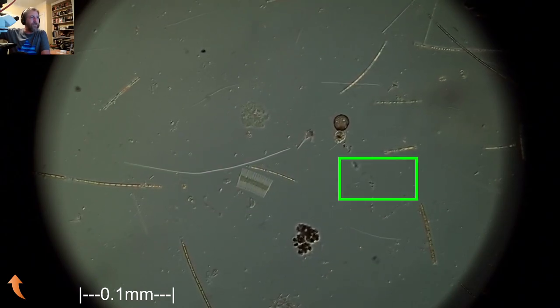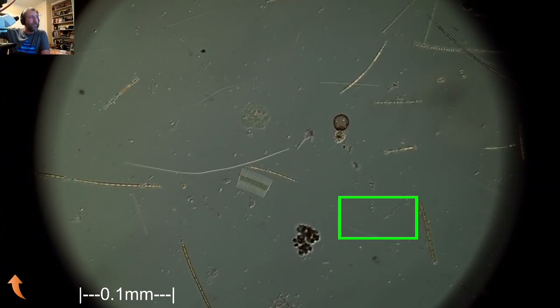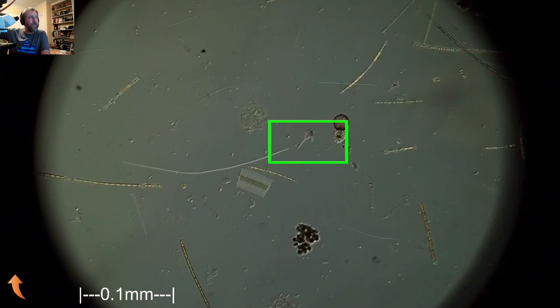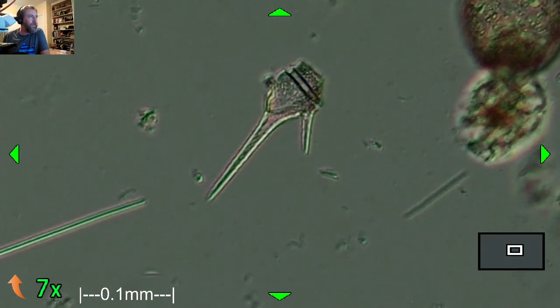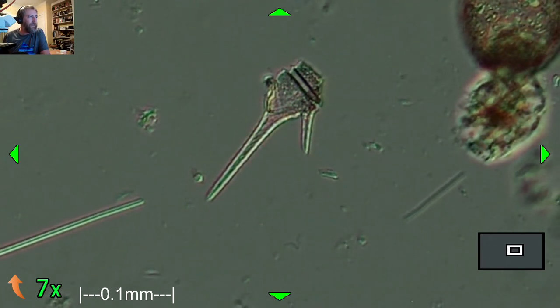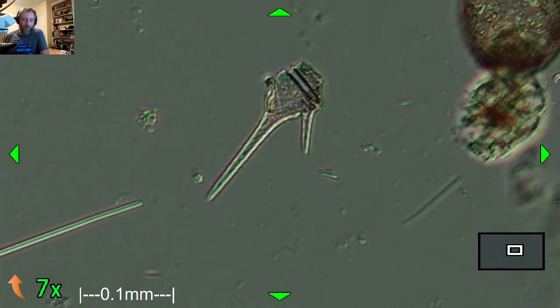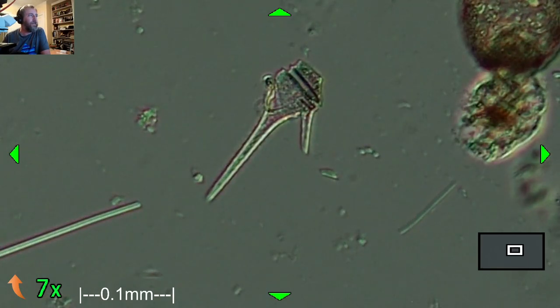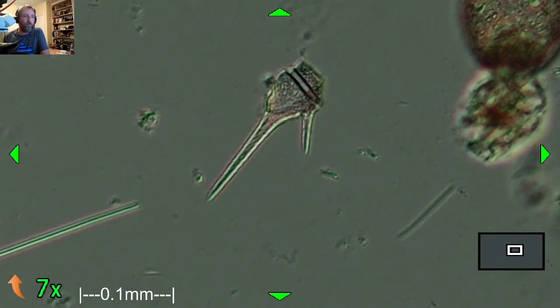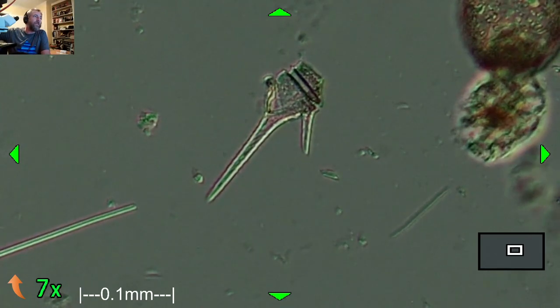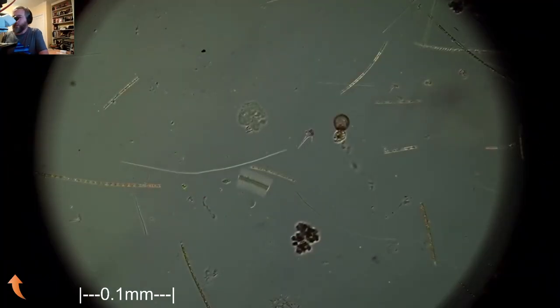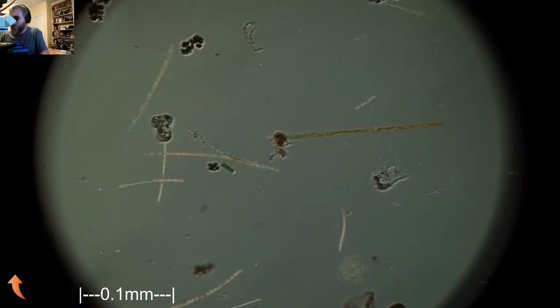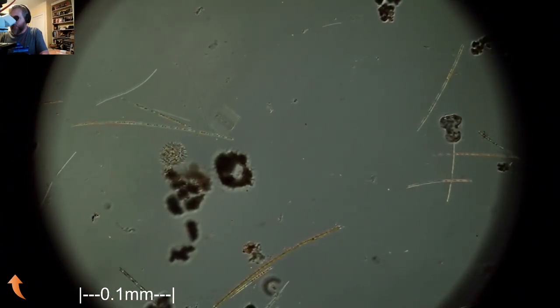So these are Fragilaria crotonensis. This thing over here is an Olicacira in that box. And that's another testate amoeba doing something. Maybe splitting. But I think this thing right here might be a dinoflagellate. Yeah. That looks like the sulcus, or the little thing, you know, the belt that goes across the midriff. And then it looks like it's made of a bunch of plates. So Tripos, I don't know what the, you know, I don't know anything about the dinoflagellate genera. So I'll defer. I think we saw some ceratium as well when we were looking around last night. I don't think it was alive.